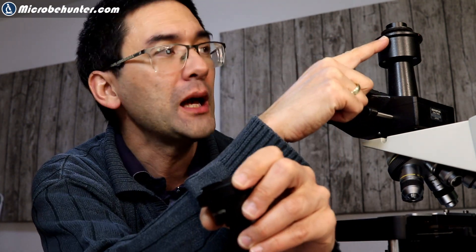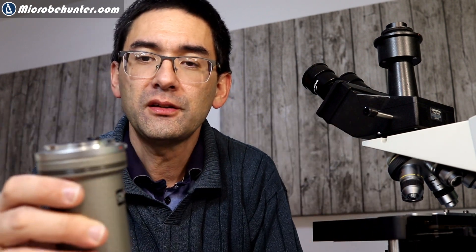You might wonder why there is such a big size difference — this has to do with the optics. The optics here is different from the photo projection eyepiece I have here. But now the question is: how in the world can I get this Olympus adapter connected to a Canon camera?